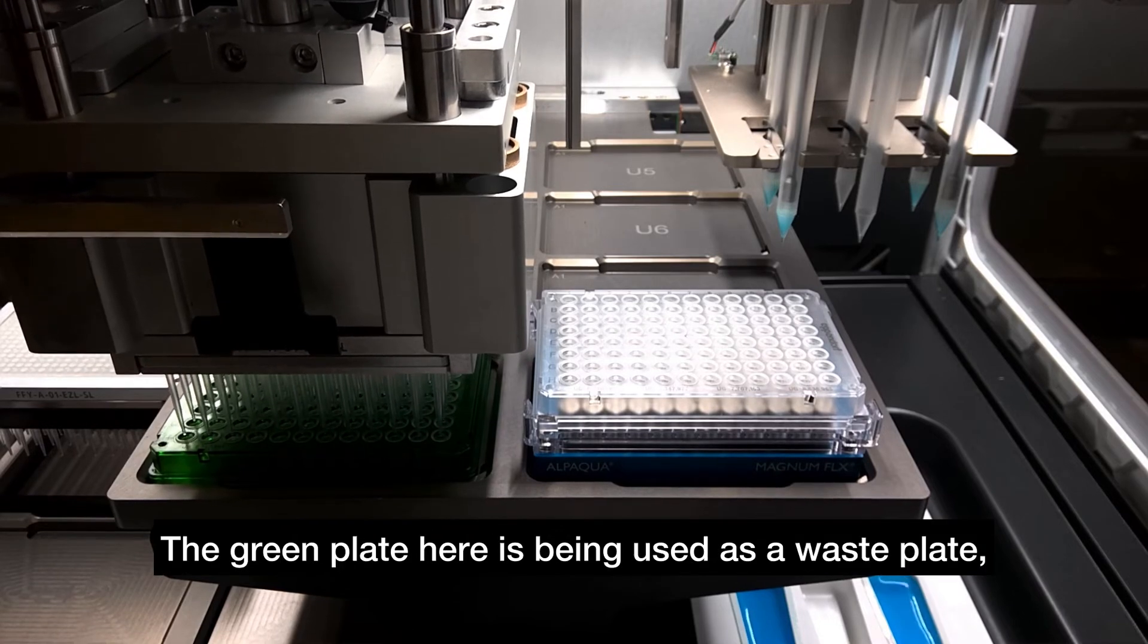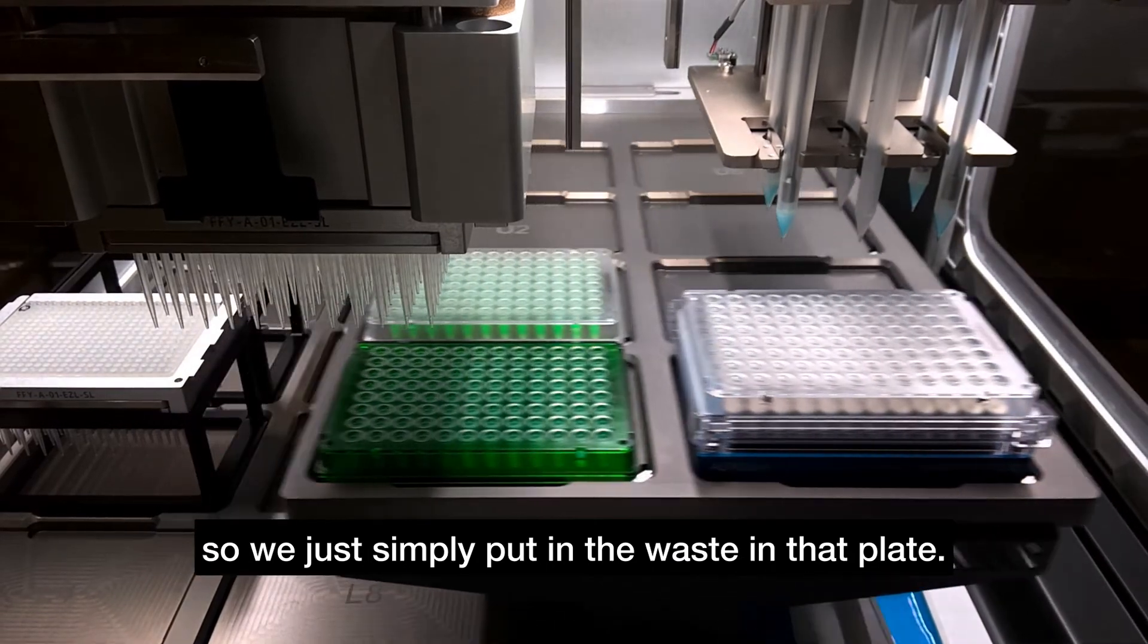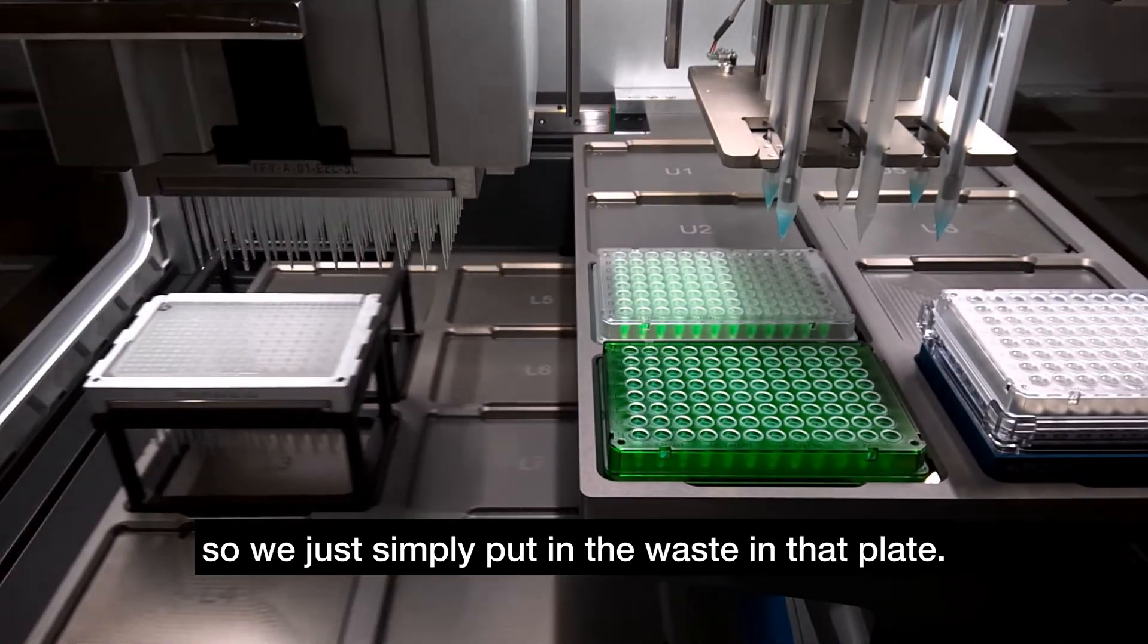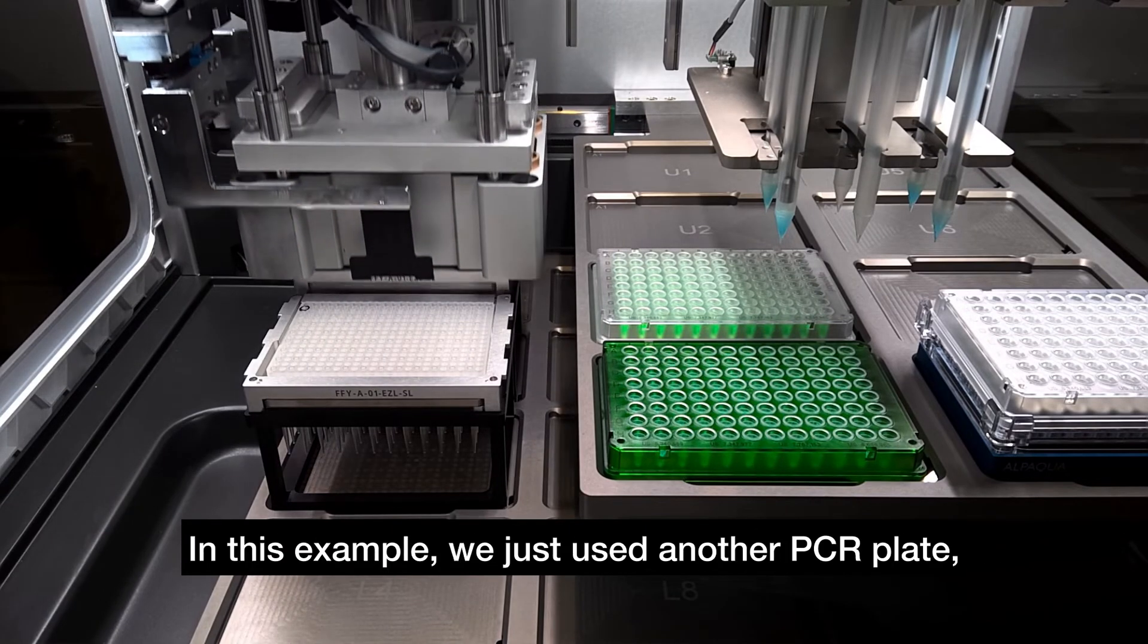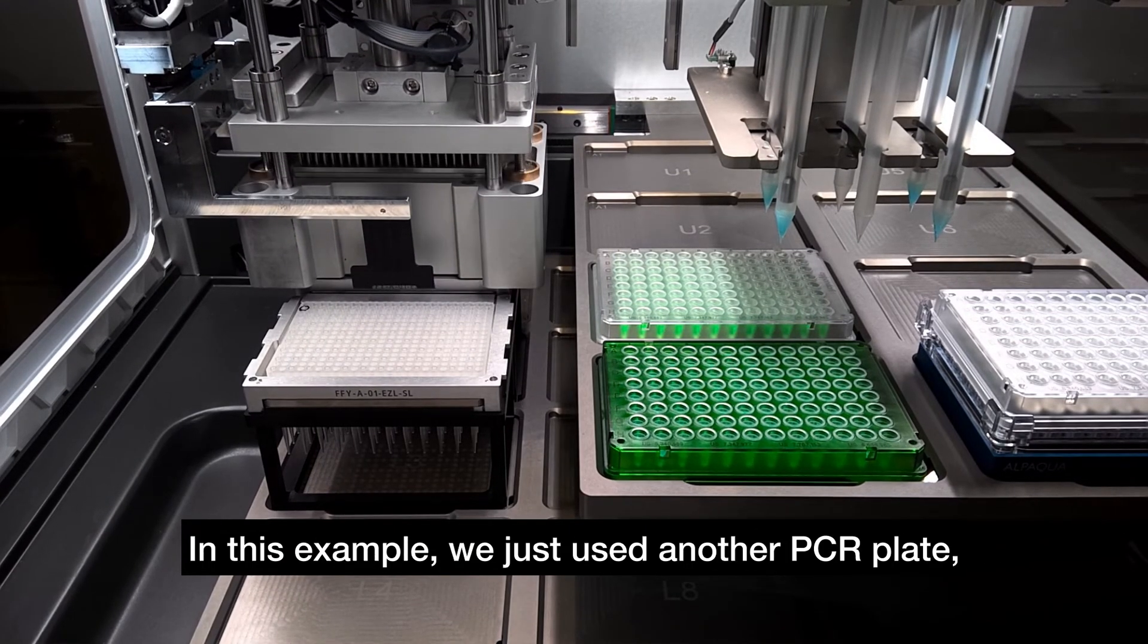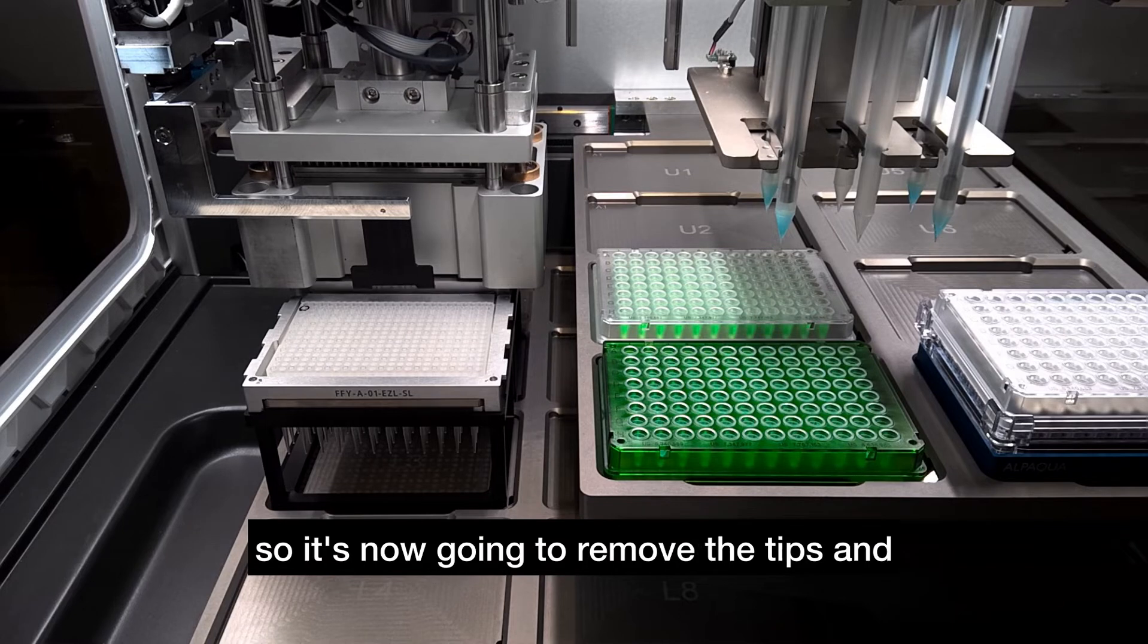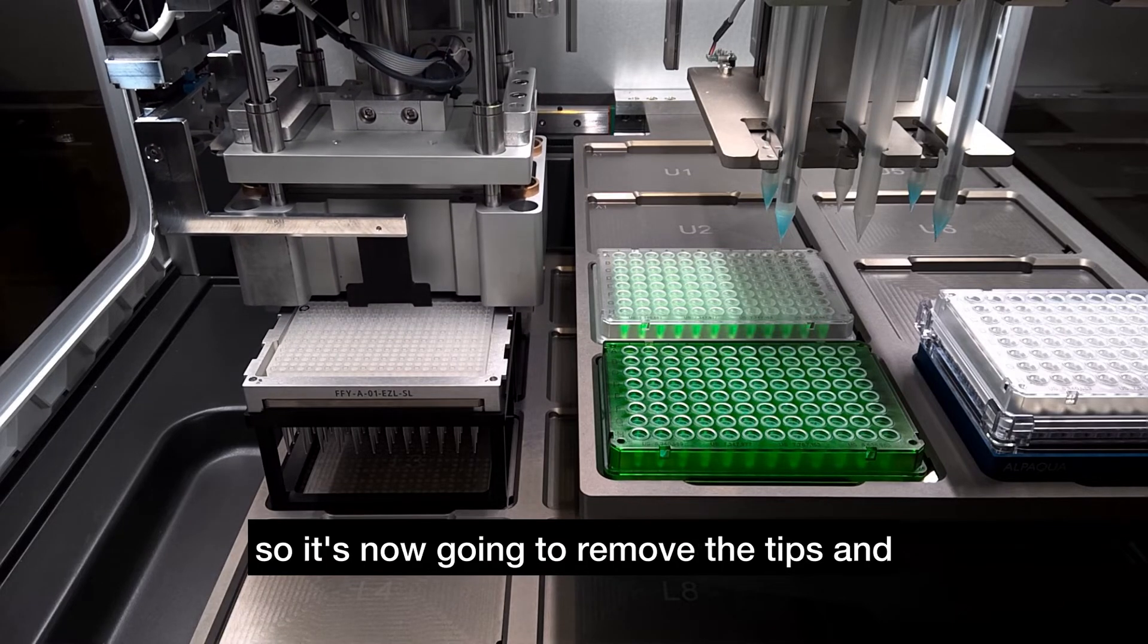The green plate here is being used as a waste plate, so just simply putting the waste in that plate. Obviously that could be a trough or a deep well plate. In this example, we've just used another PCR plate. So it's now going to remove the tips.